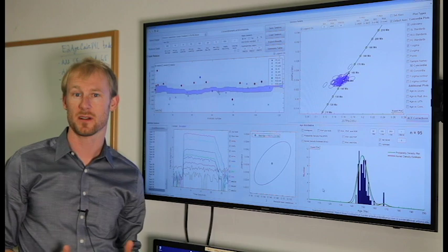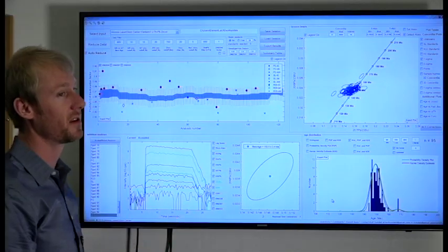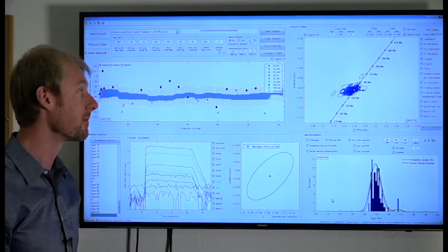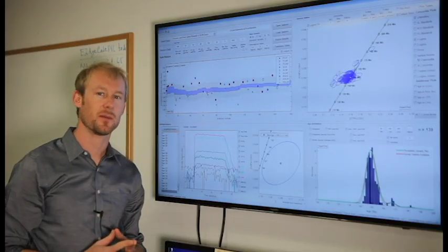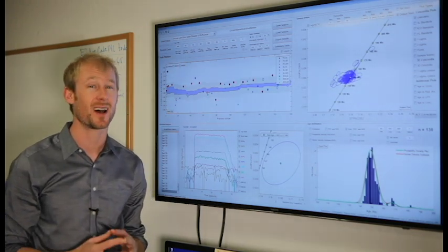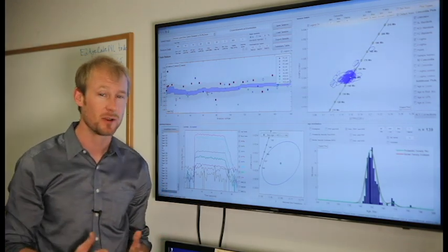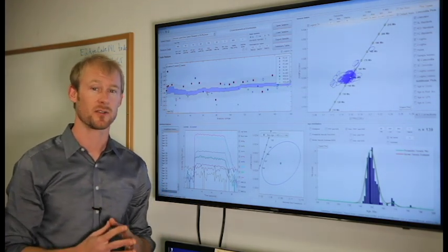My name is Kurt Sundell, and today I'm going to give a brief overview of the new real-time data reduction software that we've developed in MATLAB called AgeCalcML. This real-time software works on raw intensities extracted from the encrypted element2.dat files. So this type of live data reduction cannot really be done with the standard Thermo software.